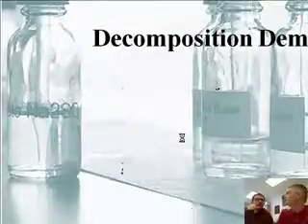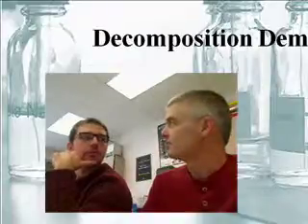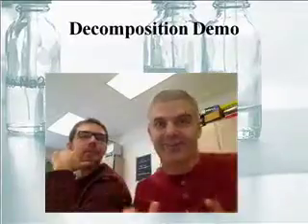Now, I think we should do a demonstration. Video! Okay, so who's going to video us? I think it's you this time. Is it me? I get to decompose and fire. I get to play with fire.